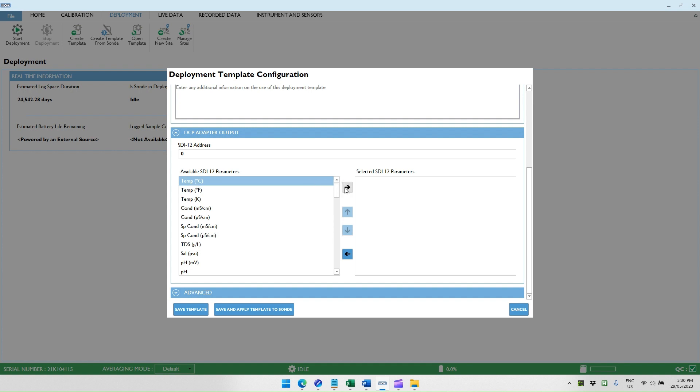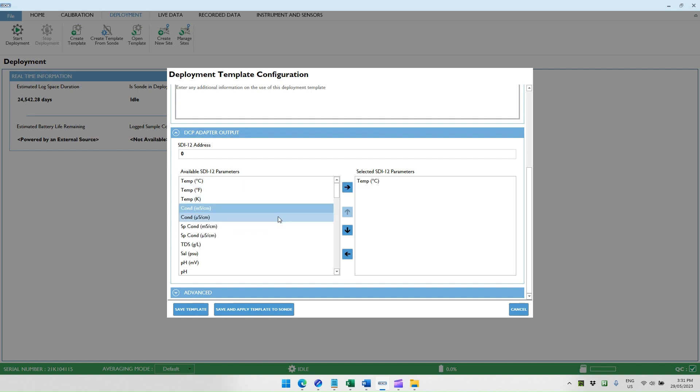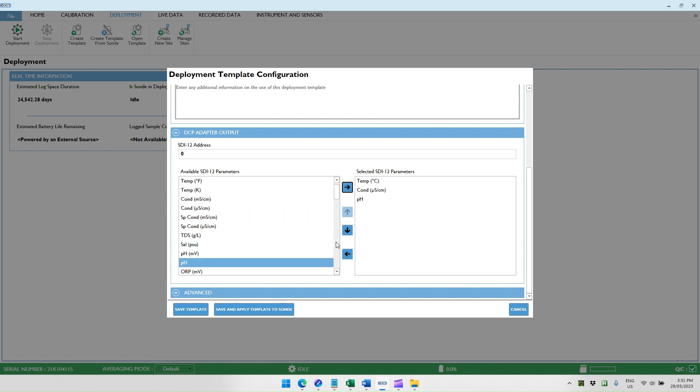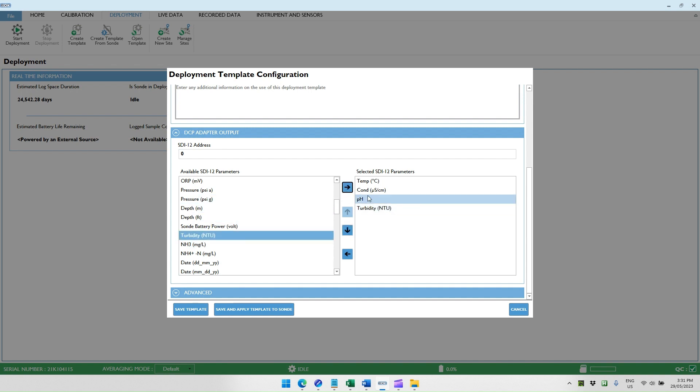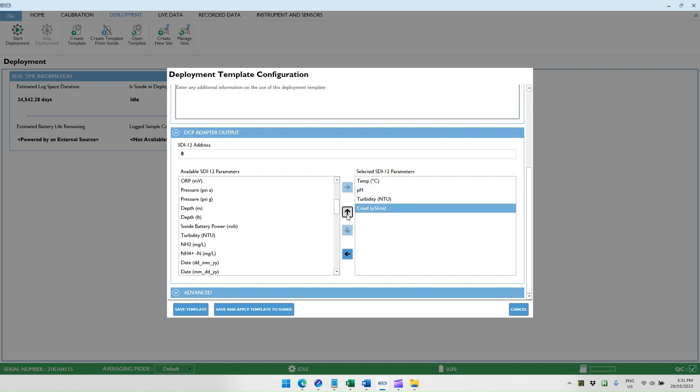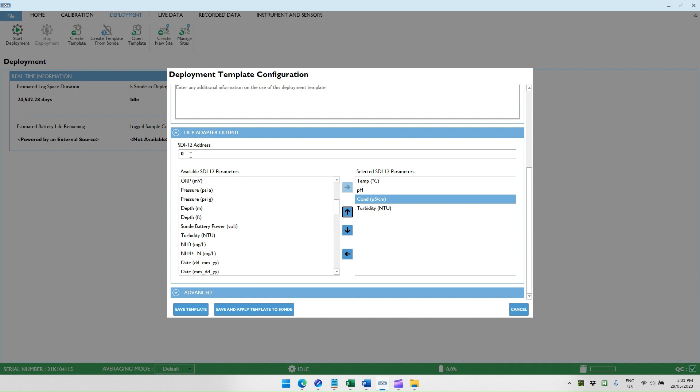Then we select the parameters that we would like to have in the output, such as the temperature. You highlight the parameter and then use the right arrow to shift it across to the selected parameters. Then you continue to highlight the parameters that you're after and list them in the selected parameters. If you want to change the order, you can highlight and then use the down or up buttons to change the sequence at which they appear. Those define the parameters that the sonde will report to the AI-1 via the SDI-12 data bus. You can have multiple sondes on the same SDI-12 bus if they all have unique SDI-12 addresses.